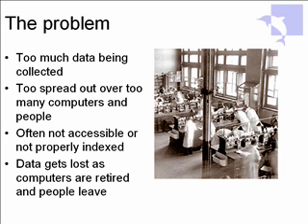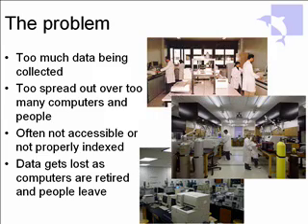So a lot of people outside chemistry, possibly outside biochemistry as well, possibly still think of this as the way laboratories look. And while in many cases the infrastructure and the benches may be the same as when these pictures were taken, that's not what a modern laboratory actually looks like in any real terms. This is actually a picture of McGill Biochemistry Department in 1921, I think. Your modern laboratories, if you can afford nice furniture, this isn't my laboratory incidentally, I get some pictures ripped off the web in the usual fashion, is full of instruments, lots of computers. Some of these are legacy computers, but some of them are up to date. But there's a lot of separate computers, and that's the core of our problem.